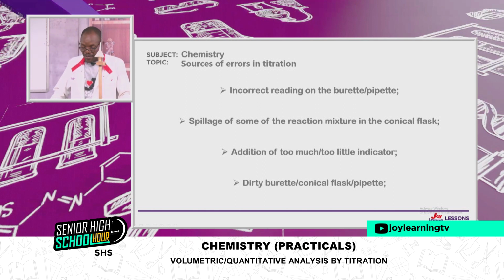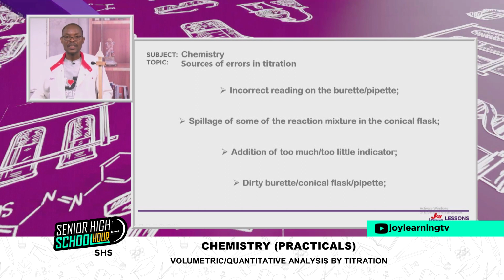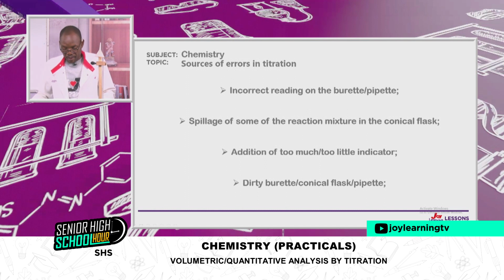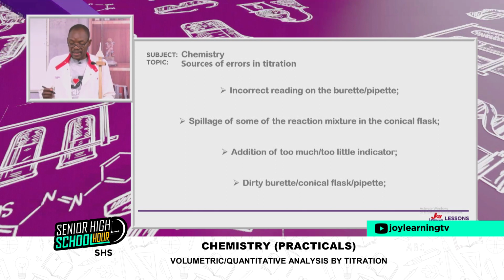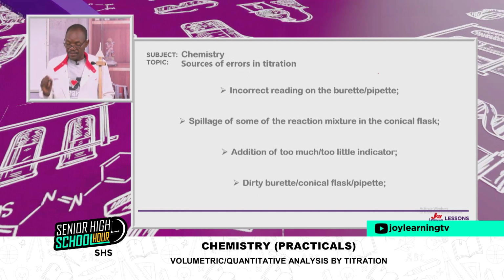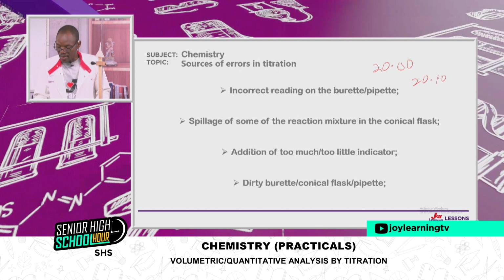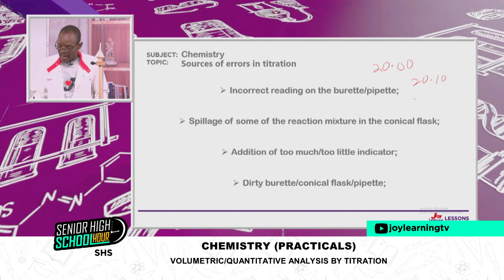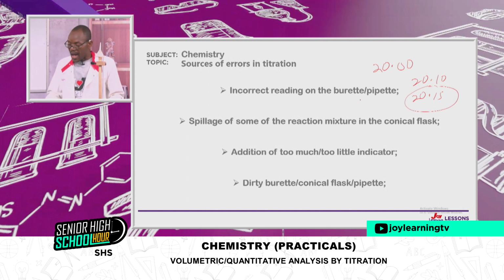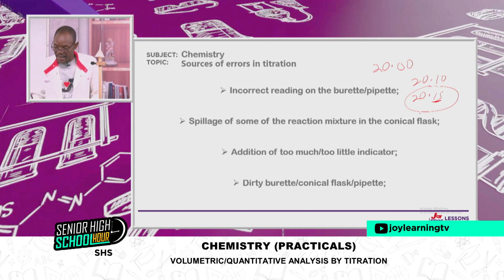Since we are performing an experiment, we should also be aware of some sources of errors in the volumetric process or the titration process. Number one on our list is incorrect reading on the burette. The burette is read in 2 decimal places for high accuracy. So I will have, for example, 20.00 or 20.10 for high accuracy. Now somebody will read the value and say 20.15. How did you get the 20.15? How did you read the 0.15? You see, so if care is not taken, you might commit an error there.